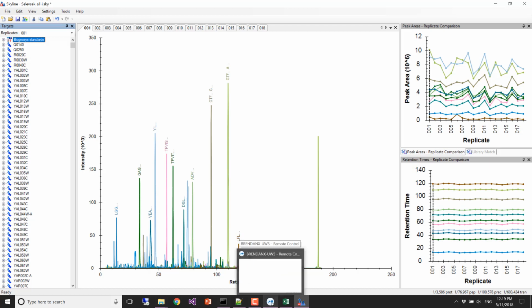So yeah, people producing actual clinical assays or assays that are going to get used a lot over thousands and thousands of runs definitely believe in this, that you're going to get better results if you can lower your noise and create more precise measurements.